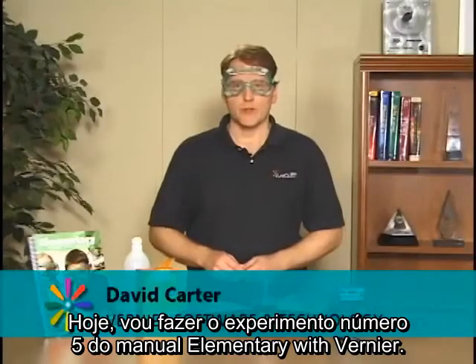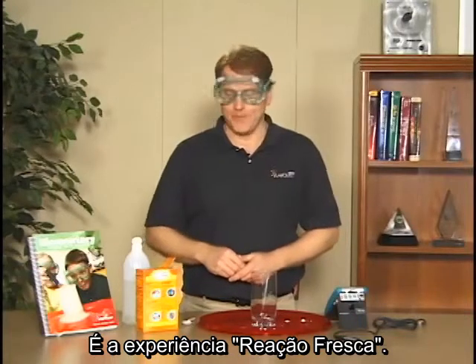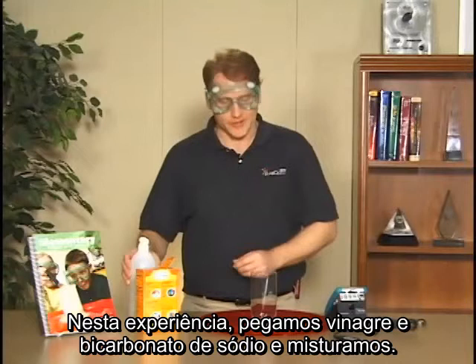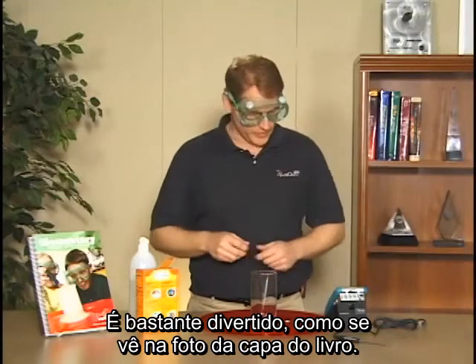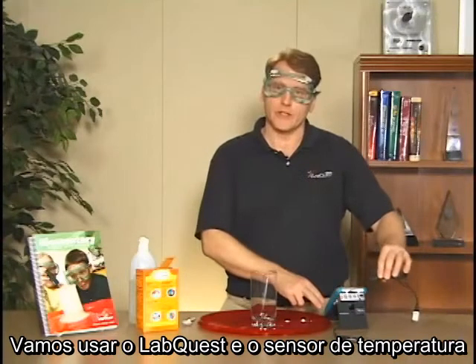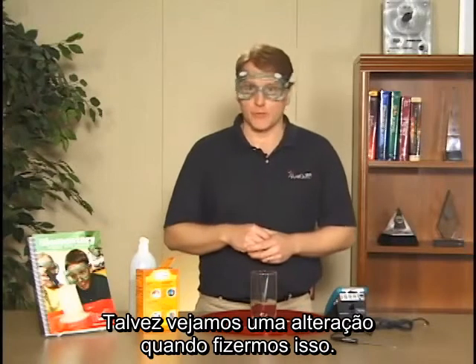Today I'm going to do experiment number 5 from the Elementary with Vernier manual, and it is the cool reaction lab. In that lab we have some vinegar and some baking soda, and we're going to mix them together. And of course that gets kind of fun if you look at the cover of the book there. But what we're going to do is use the Labquest and the temperature sensor and record the temperature as that reaction occurs. And maybe we'll see a change when we do that.